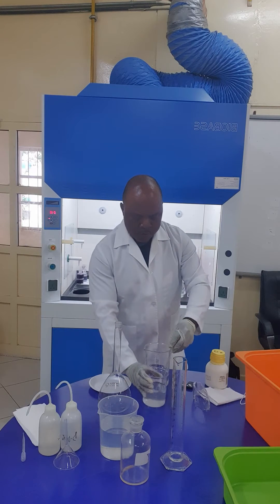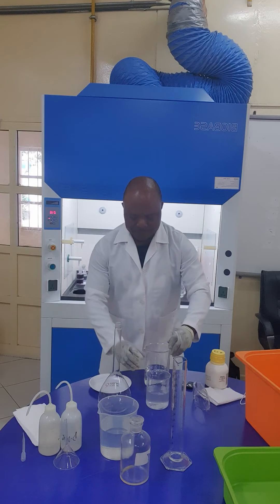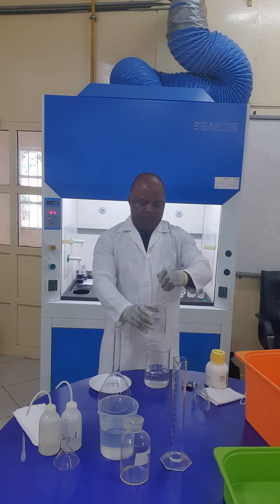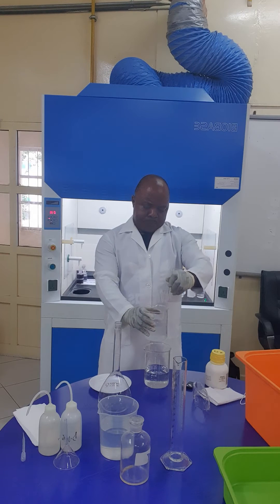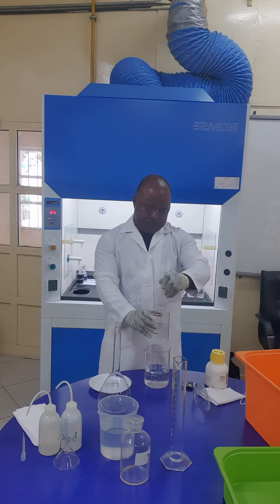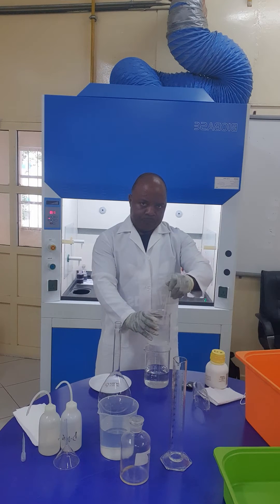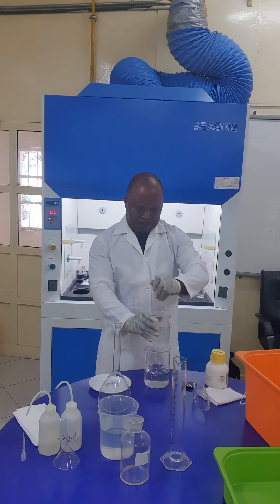Keep on stirring until all the pellets are dissolved.